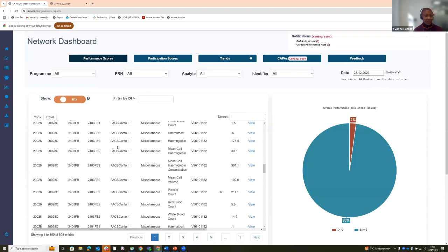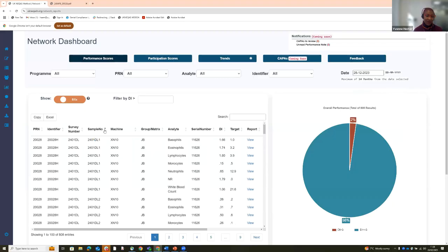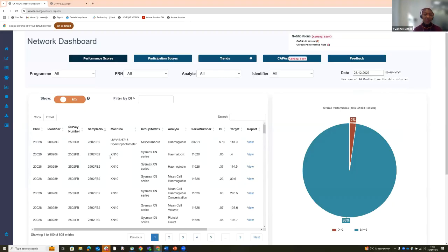Oh, I think that's a really great feedback there. At the moment, no, it's just the single date, or the single survey. So you can only toggle here to change the order of them, but we can't filter for showing two different surveys. The only way around it in that respect would be to download an Excel sheet and then do the filtering from there.